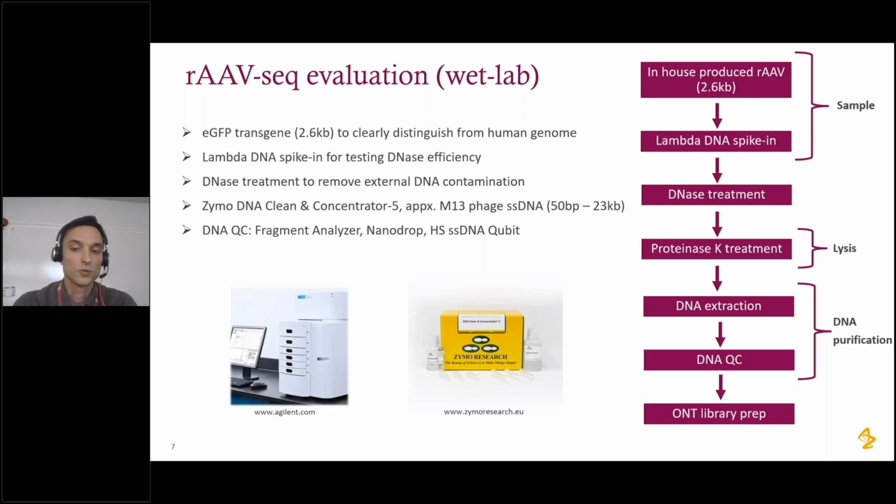And then we did a QC. We always do the QC before library prep and sequencing. This is a really important step for any NGS work. For AAV samples, we used the Fragment Analyzer. This is a capillary electrophoresis instrument that can pretty accurately size the DNA fragments.